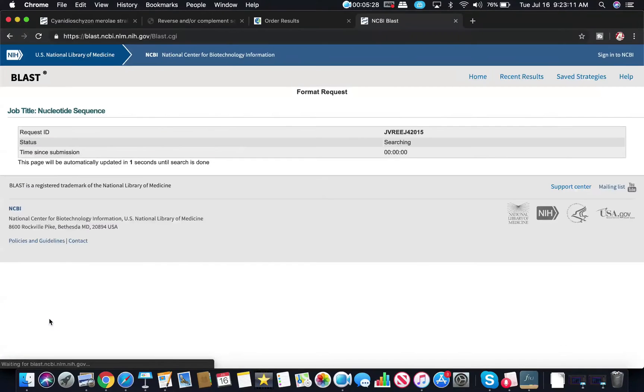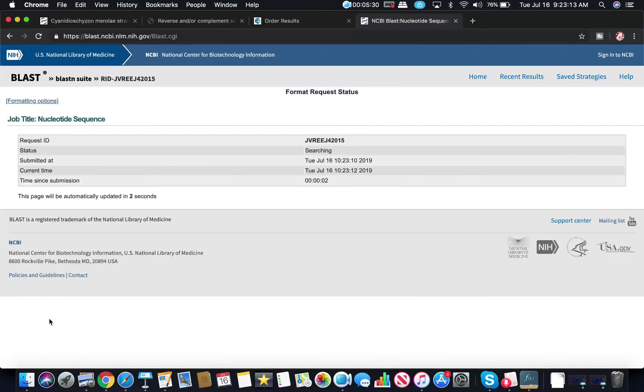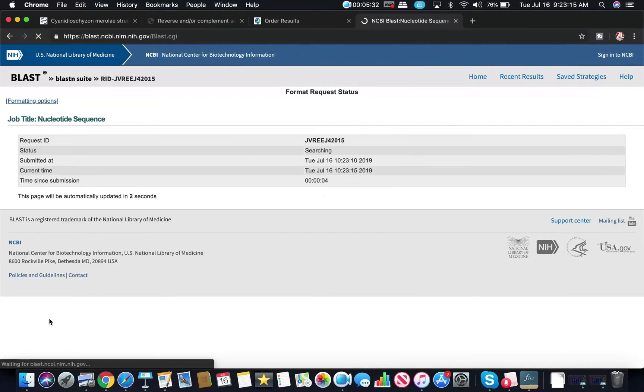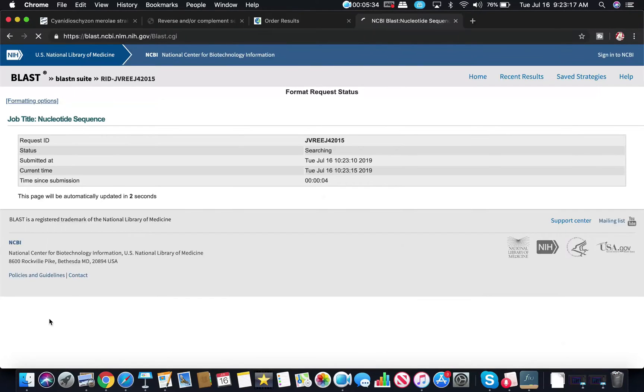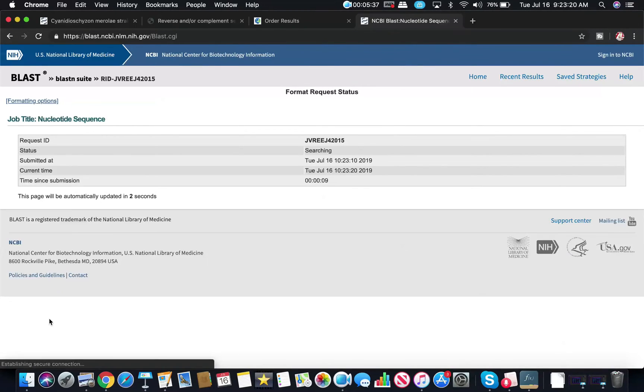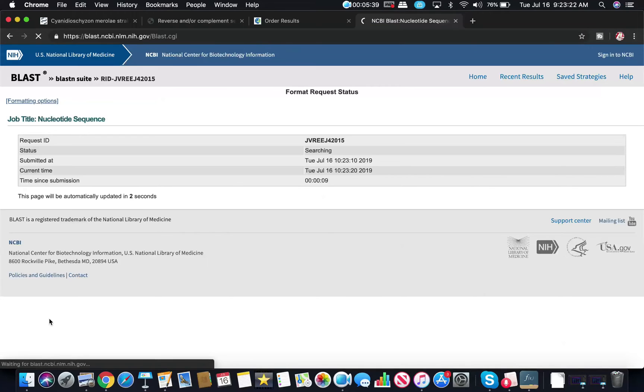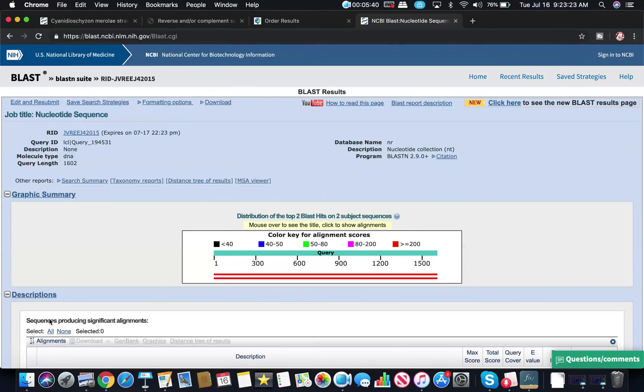You want highly similar sequences and then I just click BLAST. Sometimes this can take a couple of minutes. You want to make sure you have a decent internet connection. Sometimes it can take a little bit longer than others, but within a few seconds, normally up to a minute, you will have your results of genes.